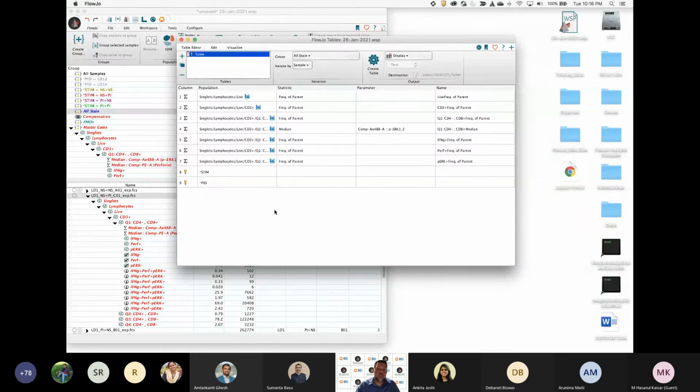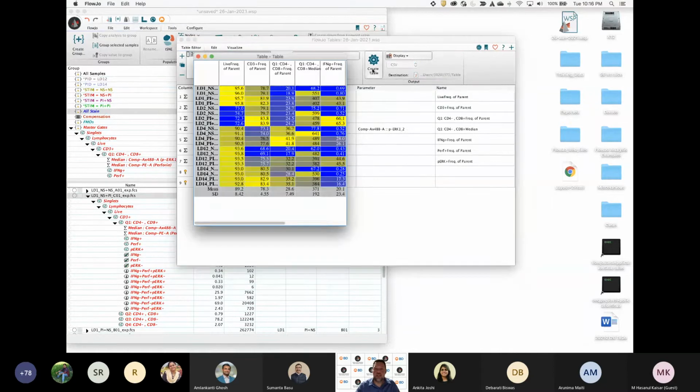So that's the final step there, is pushing out all of our numbers. Maybe you just want to go to File and make a CSV, a text file, and save it somewhere. That's fine too, but oftentimes I like to look at the data first, so I add the visualization first and then display the table to see what's going on.